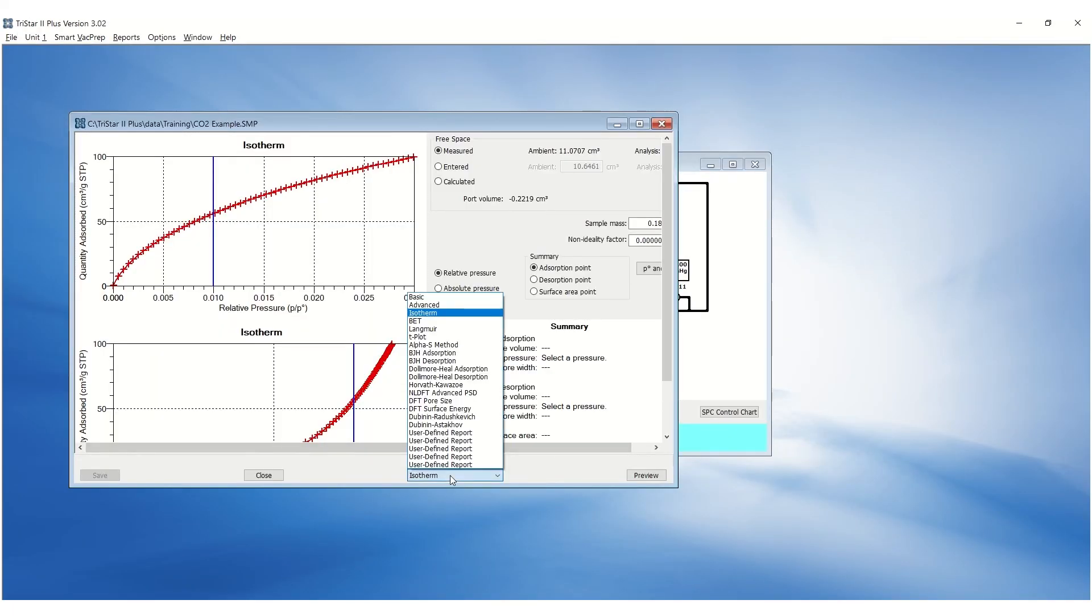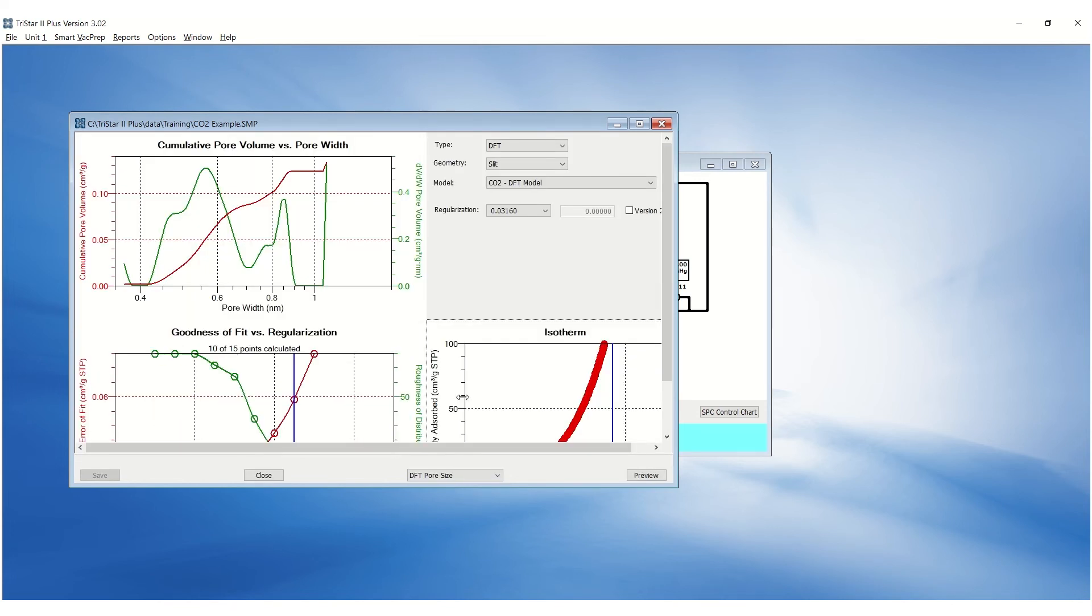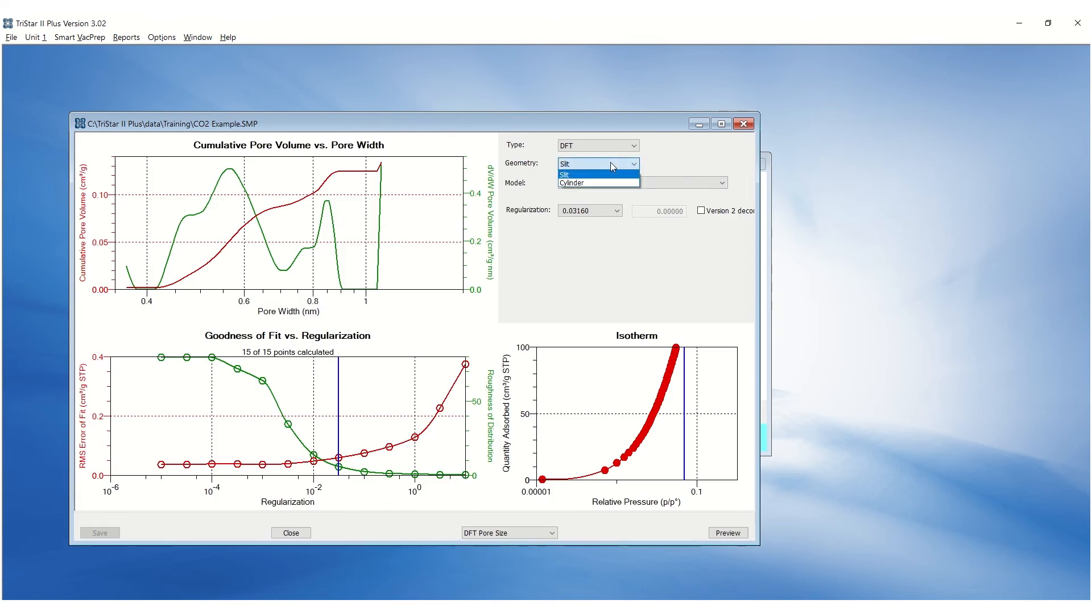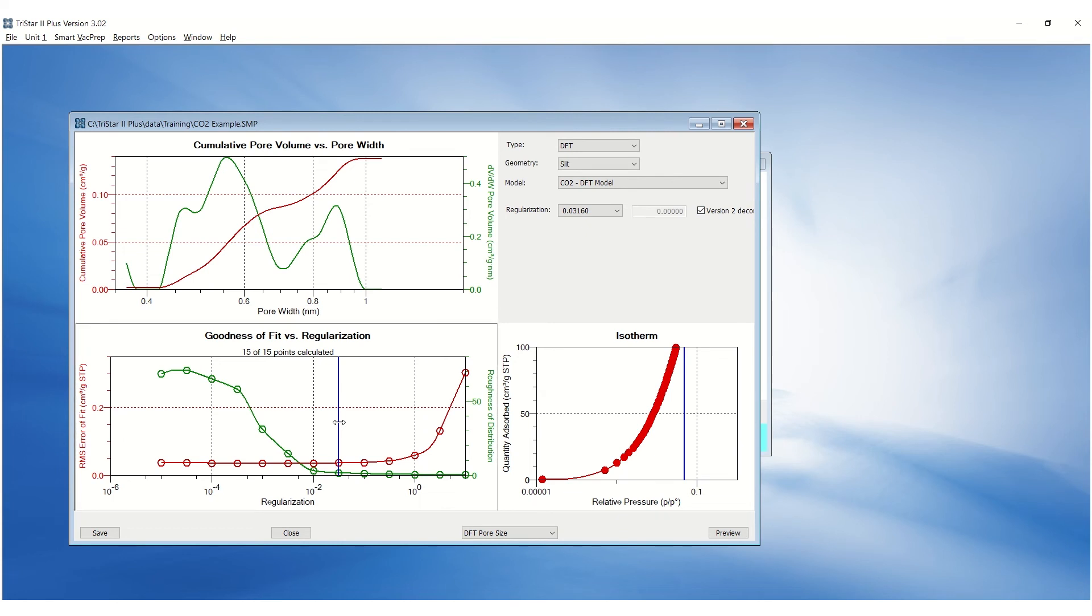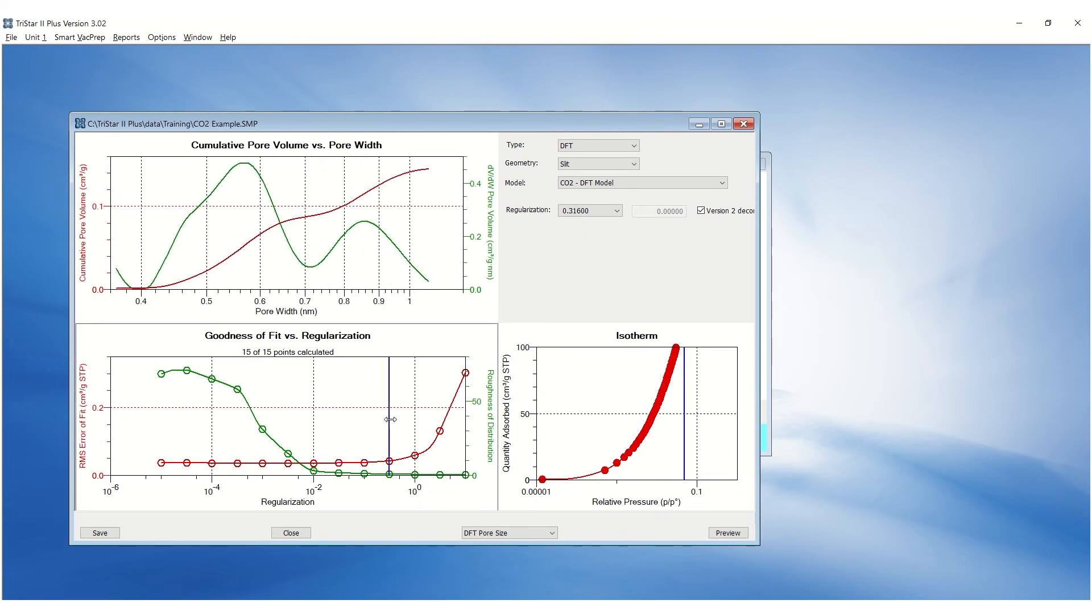To generate a pore size distribution with CO2 isotherm, click on the drop-down menu and go to DFT Pore Size. Select the slit geometry for carbon samples and the appropriate model. Select Version 2 Deconvolution to minimize the roughness. Adjust the regularization to minimize the error and roughness to view the pore size distribution.